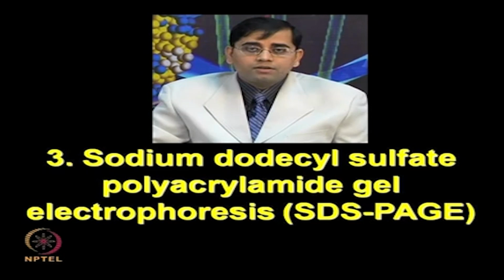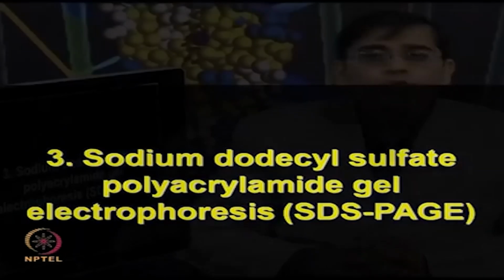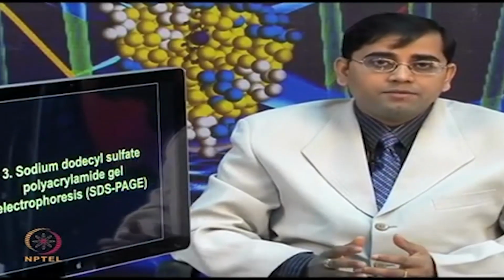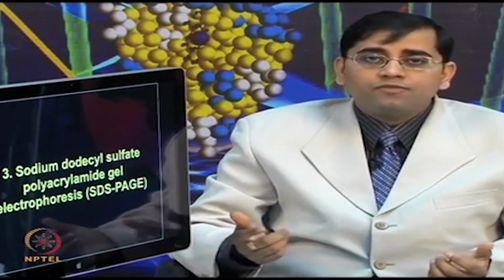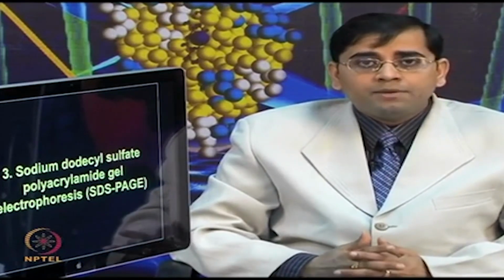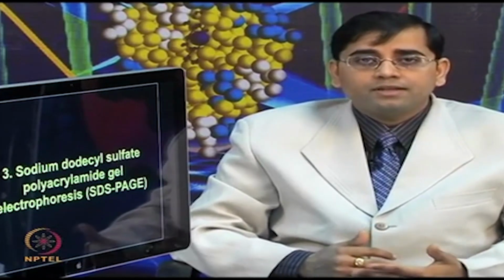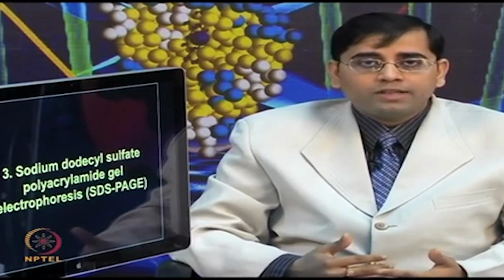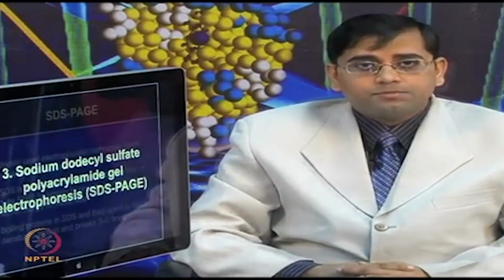Now, in this case, when you are using SDS page only in the second dimension of two-dimensional electrophoresis, then you do not need to add the stacking gel. You have already focused the protein in the gel in the first dimension based on the IEF. Now, for the second dimension separation, you have already prepared the strip to be loaded on the SDS page gel. So, the rest of the steps can be uniform or similar to what one can expect in regular SDS page.